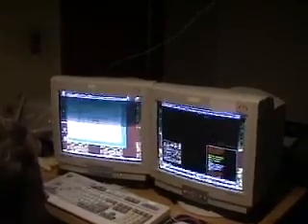You have to resist the temptation to click on them in the image, because if I click on them in the image, it makes the line that I have selected disappear.